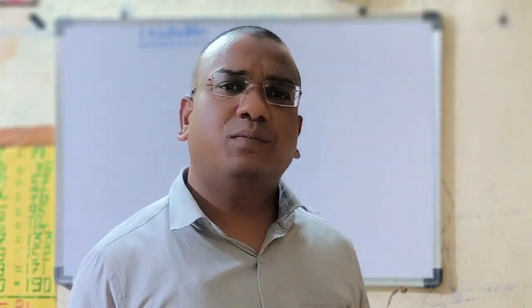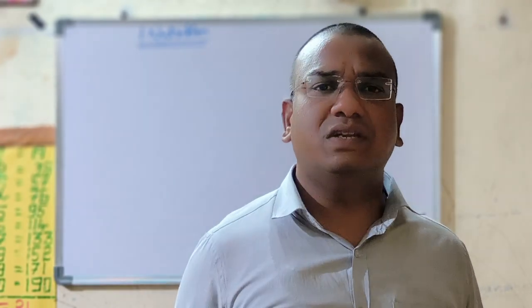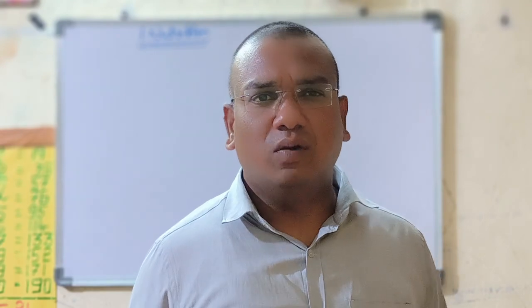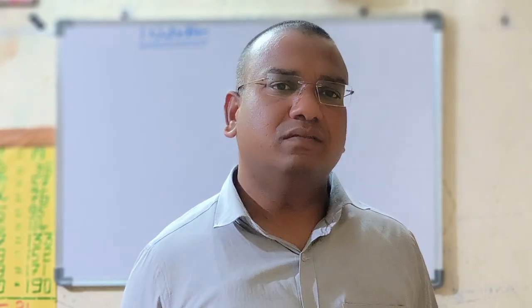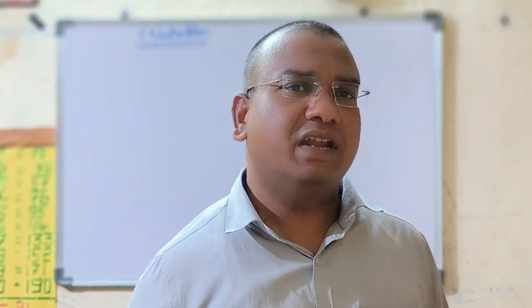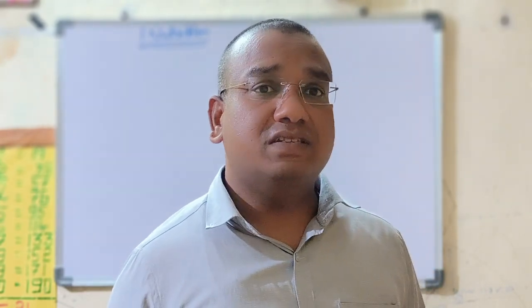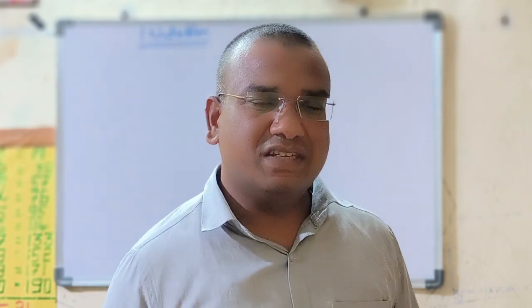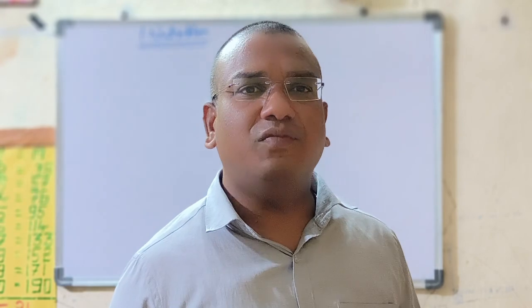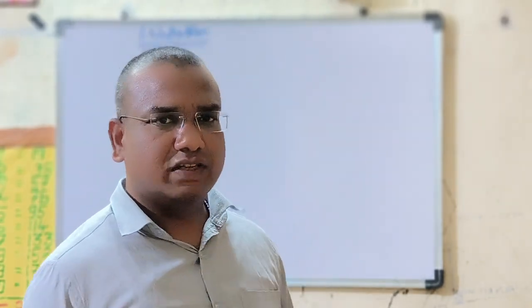Today we are discussing the 10th class nutrition lesson. In that, one of the experiments is how plants use carbon dioxide for photosynthesis. With the help of this experiment, you can easily understand how plants use carbon dioxide for photosynthesis. This experiment is also called the moll's half-leaf experiment.